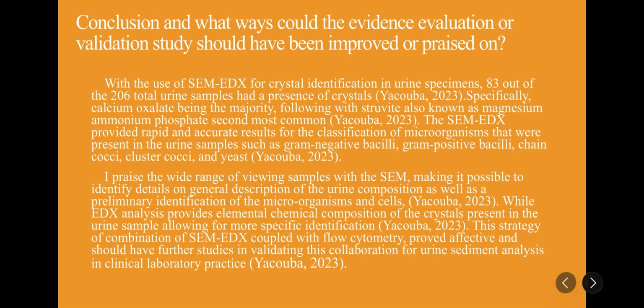I praise the wide range of viewing samples with the SEM, making it possible to identify details on the general description of urine composition, as well as preliminary identification of the microorganisms and cells. While EDX analysis provides elemental chemical composition of the crystals present in the urine samples, allowing for more specific identification, this strategy of combining SEM-EDX coupled with flow cytometry proved effective and should have further studies validating this collaboration for urine sediment analysis in clinical laboratory practices.